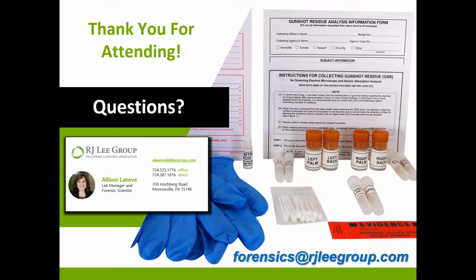In my experience, no, the dabber has not run out of stick. What's most important is that you get the most probative area first. So as long as you sample from in between the thumb and the forefinger first, that's the area where you're going to get potentially the highest concentration of particles.